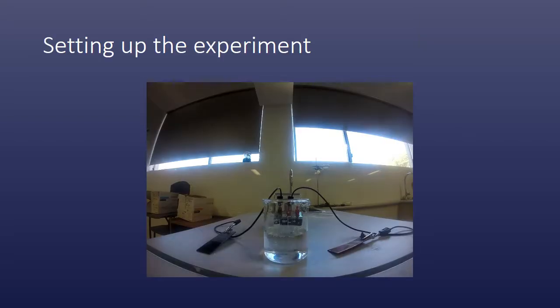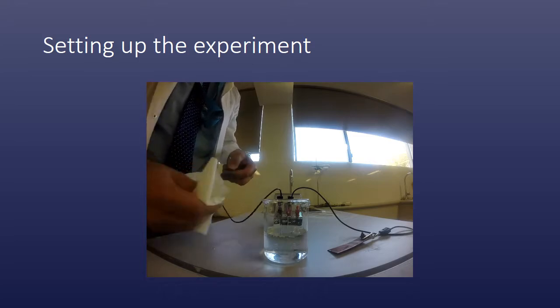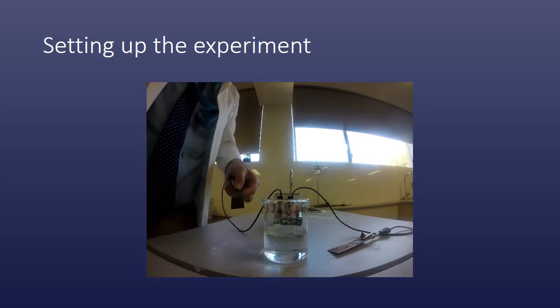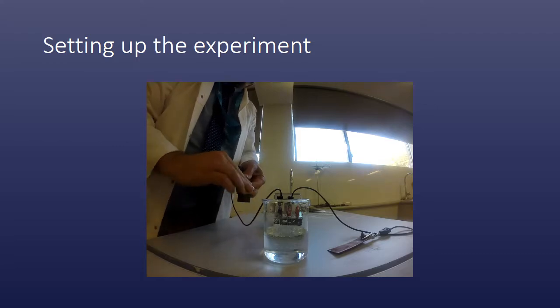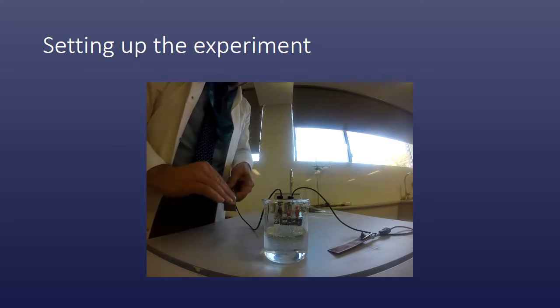So that you can see, we've got a solution. Actually, in this case, it's just distilled water. I also have two electrodes. I have a zinc electrode here, which I'm just going to dry a little bit and also clean up a little too. It's important that you keep your electrodes nice and clean, because that is going to affect your results.